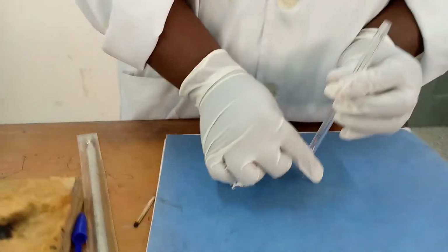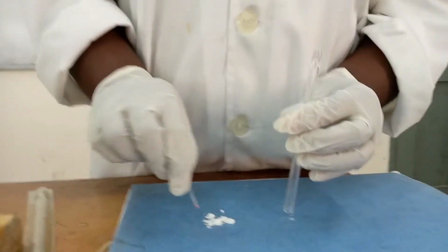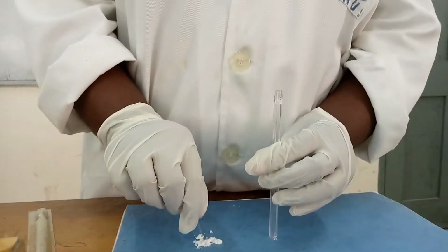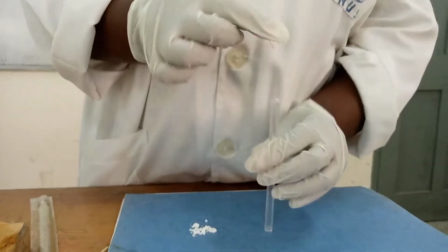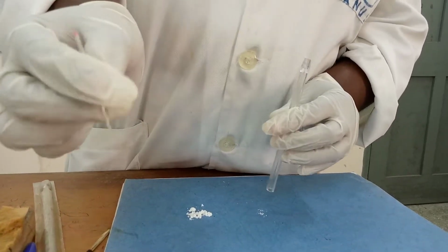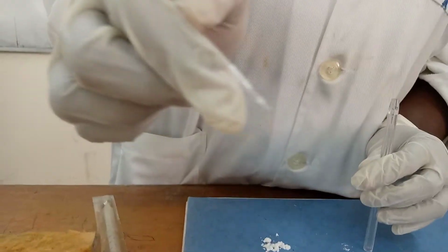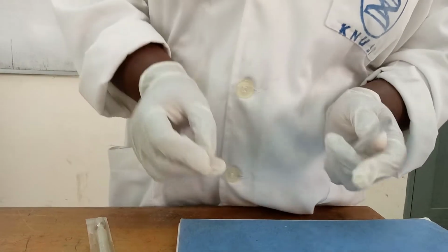So this is how you fill it. So you dip it like this, then you drop it in the case. So as you keep dropping, you see that the sample will settle at the bottom. So if I can bring it a little bit closer, it is going down. So that is how we fill the tube.